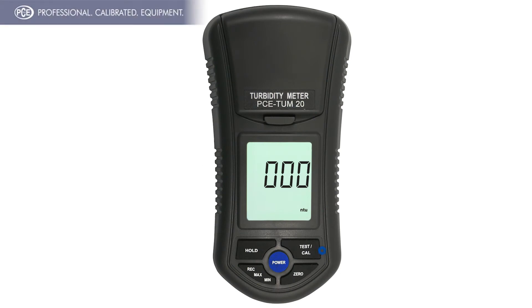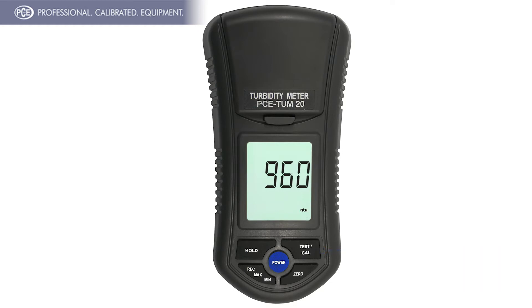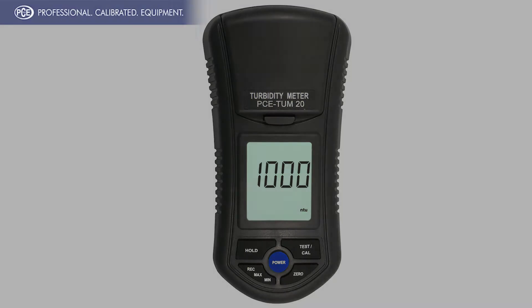The Turbidimeter PCE TUM20 is a handy measuring device which provides all requirements for measuring on-site. The measurement is done by through and scattered light procedure. The measuring instrument determines through this the cloudiness from 0 to 1000 NTU, respectively FTU.